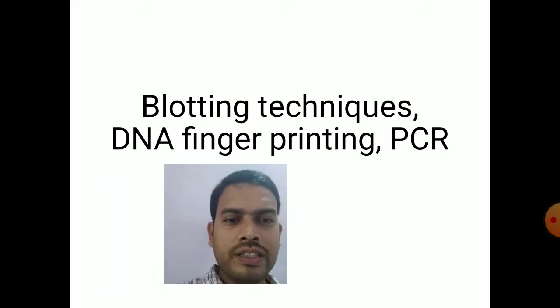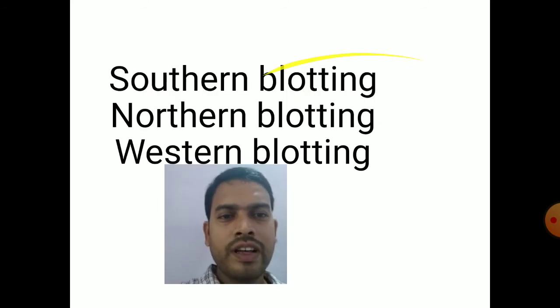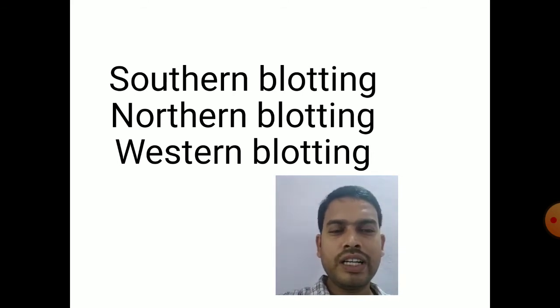Today I am going to discuss a few topics of molecular biology, also called basic experiments or topics involved in molecular biology. Those are blotting techniques, DNA fingerprinting and polymerase chain reaction, which is also called PCR. Coming to the blotting techniques, there are three major blotting techniques, which are the basic blotting techniques and the heart of molecular biology. Those are Southern blotting, Northern blotting and Western blotting.